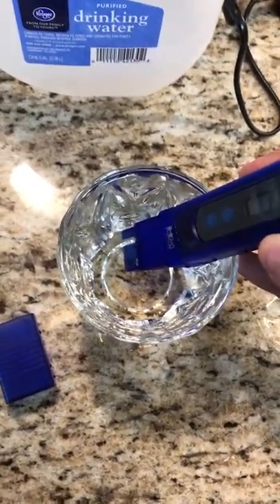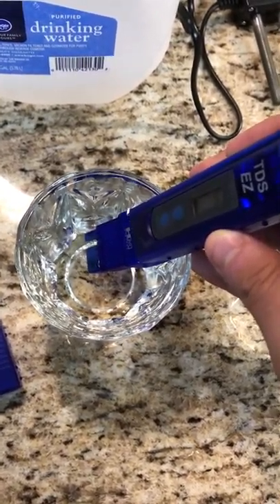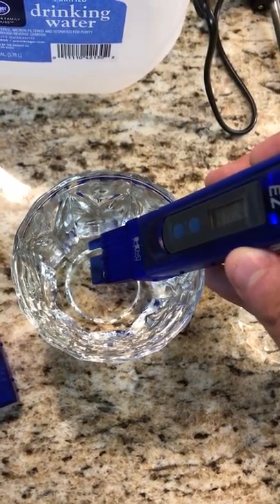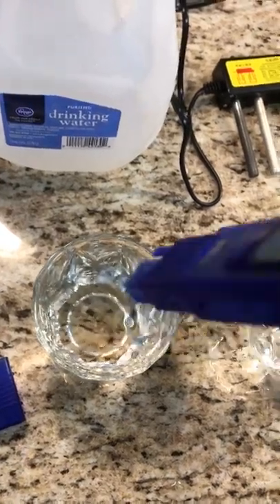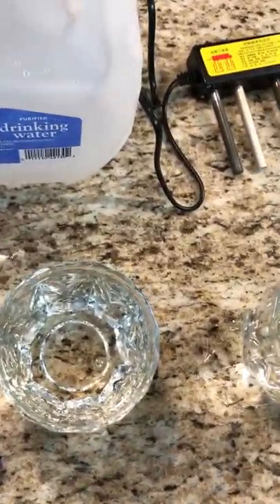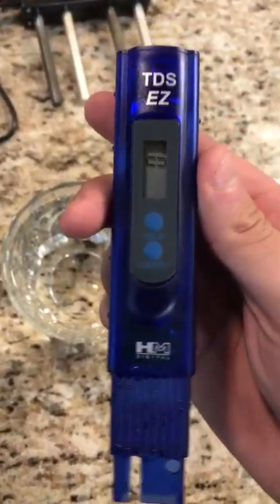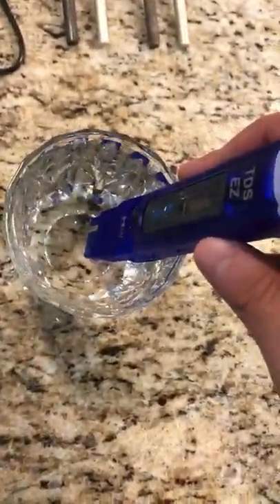According to the chart on the back, that is within the range of perfectly acceptable drinking water — you shouldn't be concerned about this water. We're going to pull it out, wipe it off, and put it into the glass on the right. The reading is zero parts per million and we're going to put it in and let it sit for a couple of seconds.